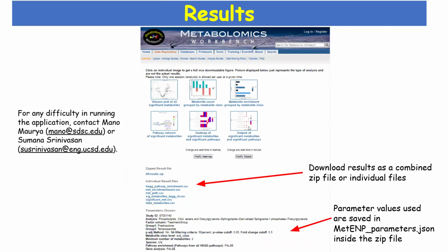For two of the plots, depending upon how many metabolites are listed or how many pathways are listed, the font size can be a little bit small or large. So we have the option to adjust those font sizes so that you can get a good quality view of these results.